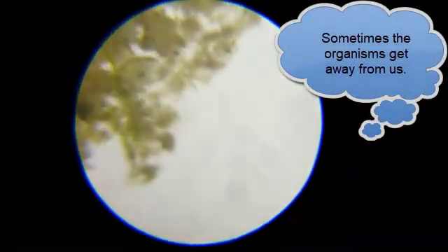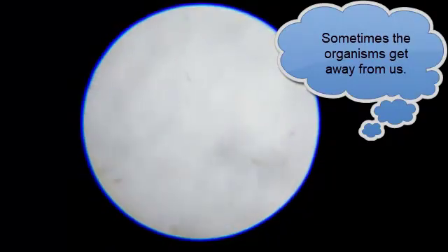They do breathe oxygen. The mosquito larvae has a, at the tip of their tail is... I lost him. But they will attach to the surface of the water. They'll break through that surface tension, that thick skin.